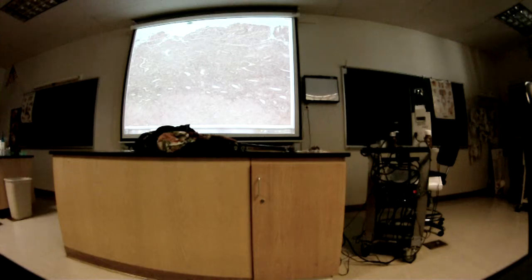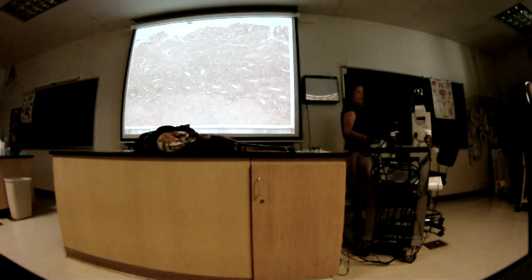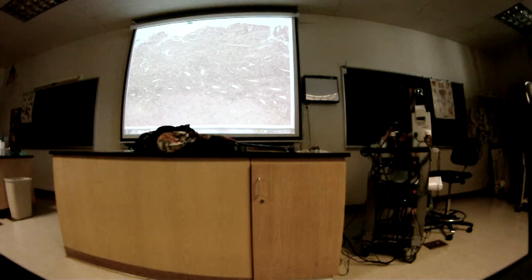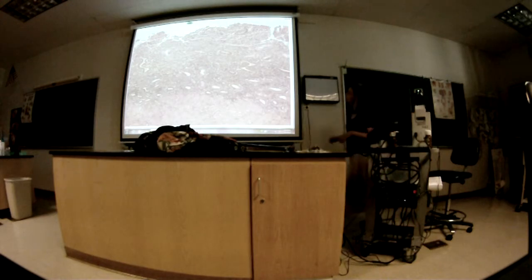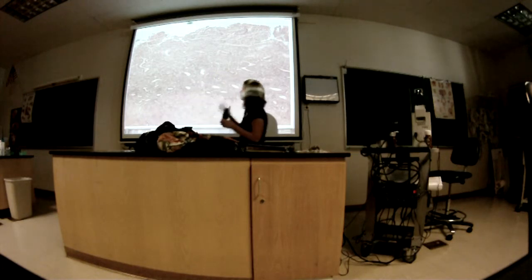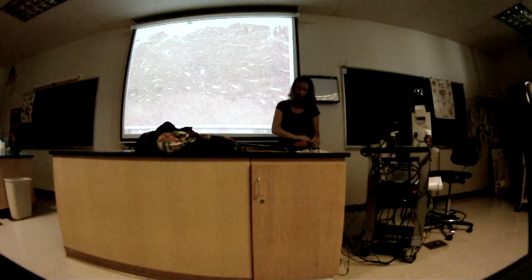Alright, I just printed that. The uterus. This particular slide is in the menstruating phase, and so you're not seeing the lining, the simple columnar lining, because that has already been shed, the endometrium. Let's see, your slide list is endometrium, uterine glands, myometrium, and smooth muscle. So endometrium is not present because it's been shed, like I said. It would be at the top. And then underneath that is the underlying connective tissue, which you're seeing up there at the top.